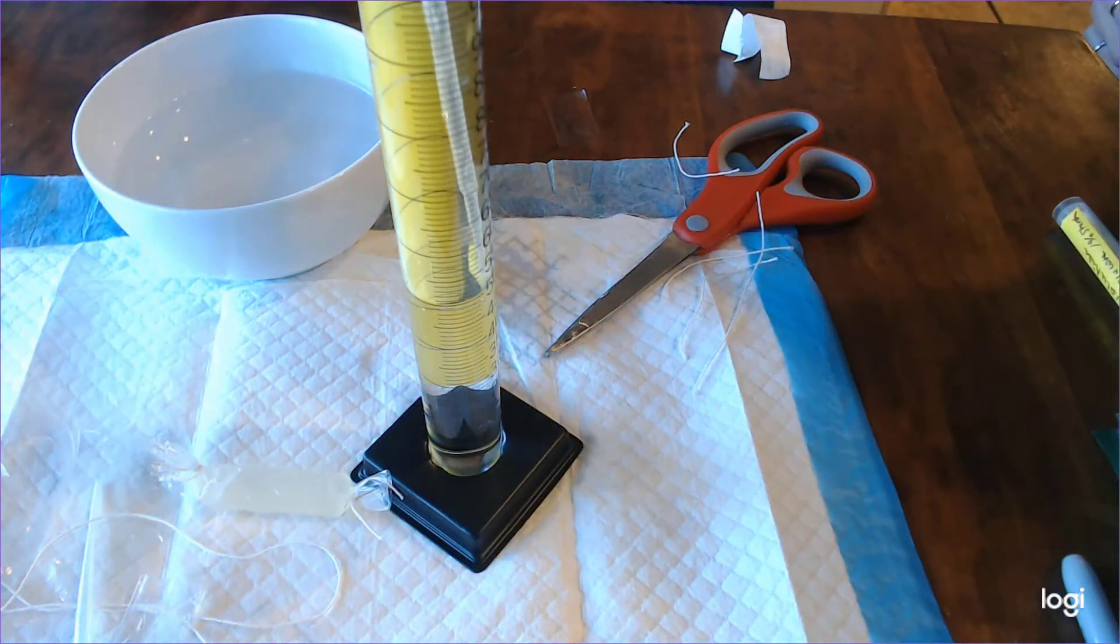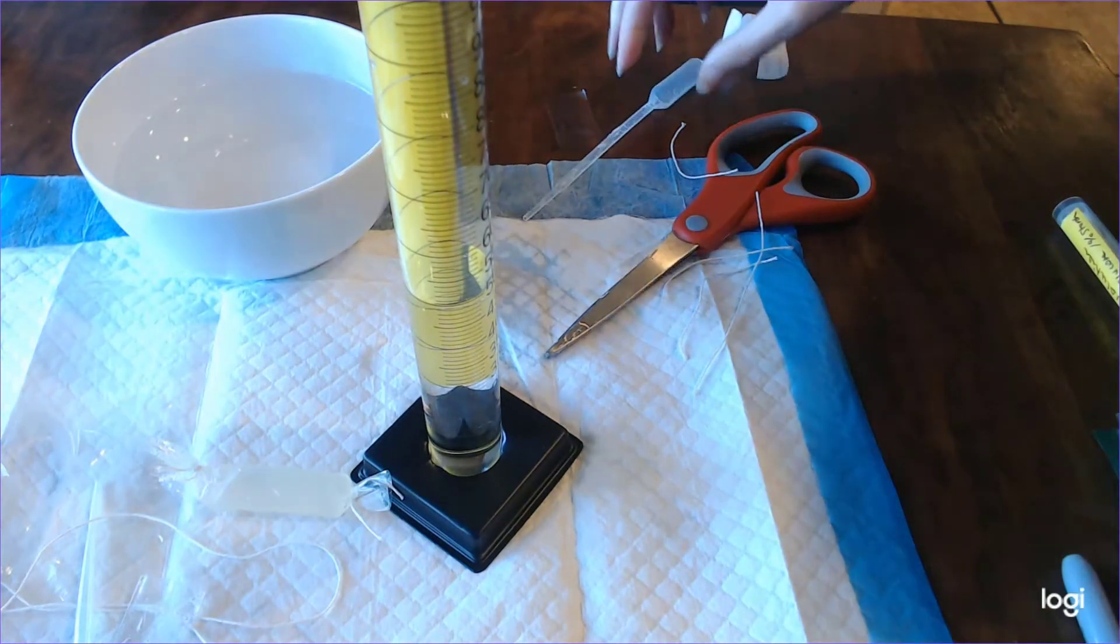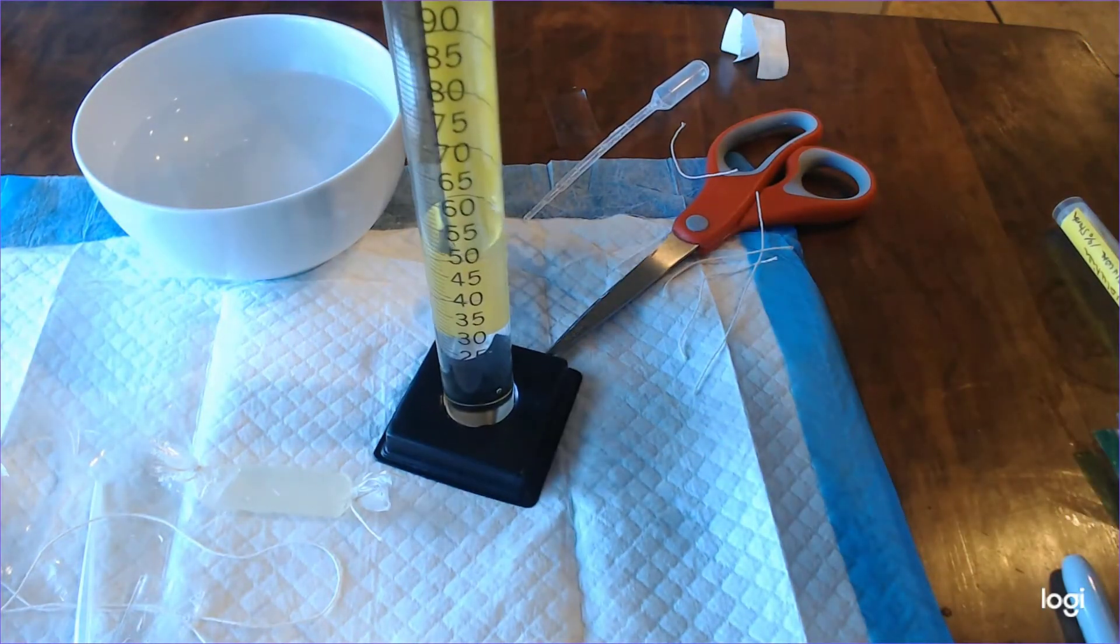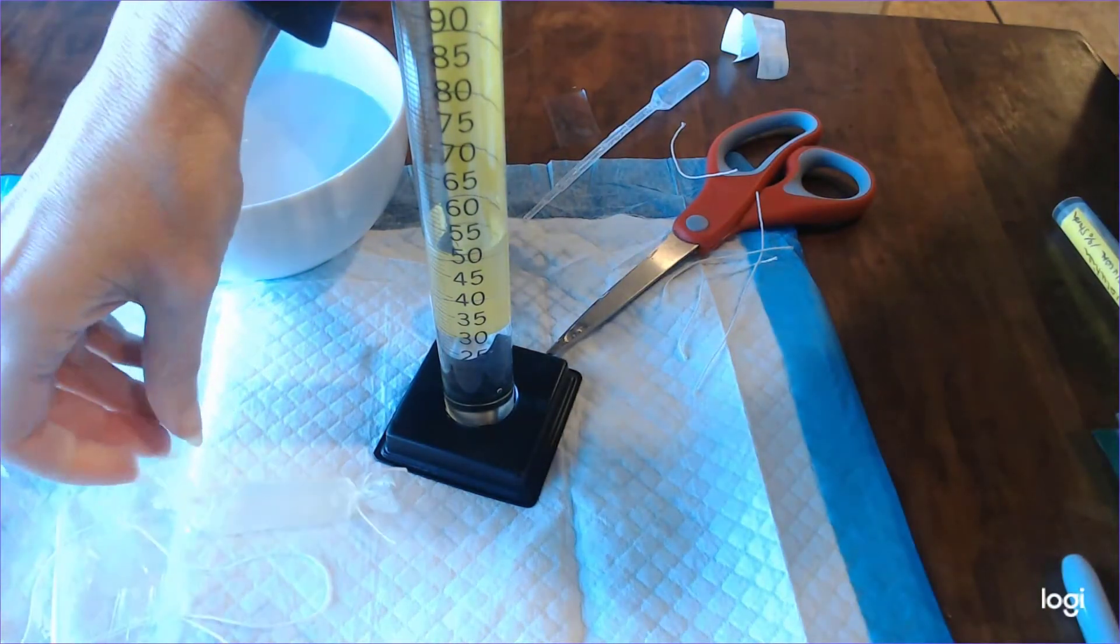To remove a little bit of the excess water so that I can get exactly 50 milliliters, I'm going to use my pipette. So now I'm at exactly 50 milliliters.